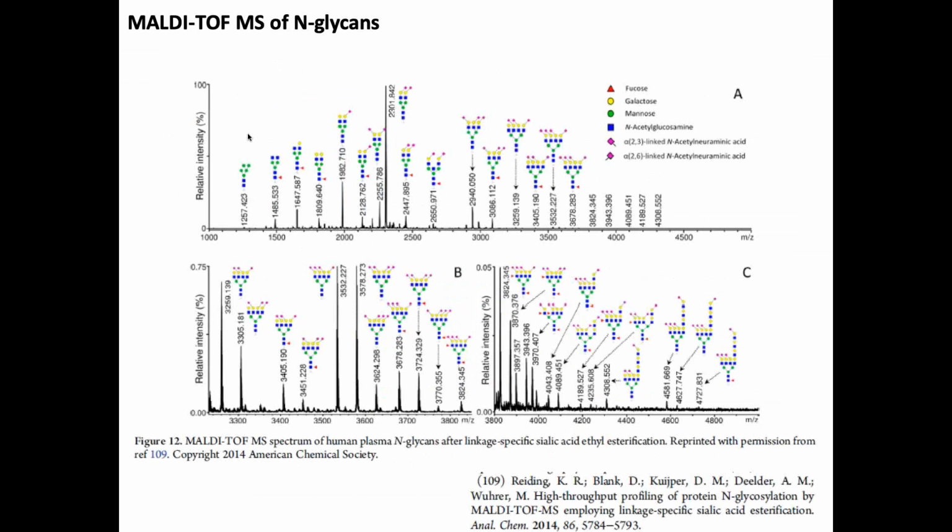They went through a series of sample preps, which probably included reduction, alkylation, and digestion. And then they were left with your protein, your glycopeptides, and your regular peptides in this mixture. And then they treated it probably with a PNGase-F, okay, which we'll talk about in more detail later. And so what you're seeing are all these glycans that have been cleaved off of all of the plasma proteins and put into a matrix.